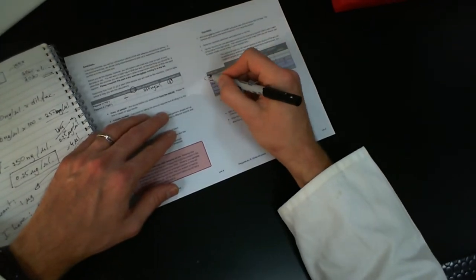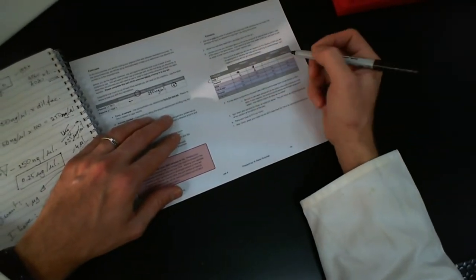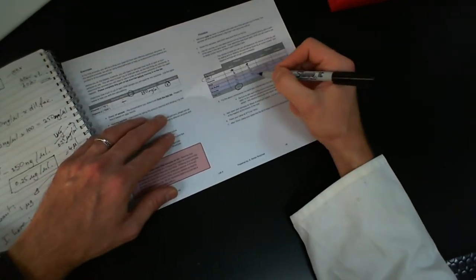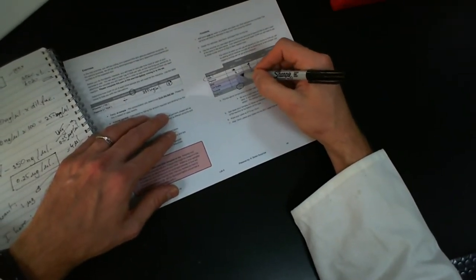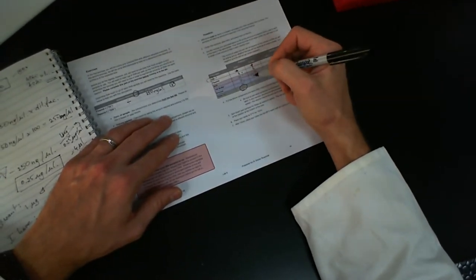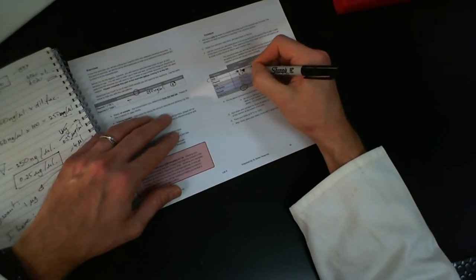And this one here, you're going to figure out based on how much plasmid you have how much water. So again, we're going to have a total volume of 20 microliters in this digest. We have a total of 6 microliters of different components being added to this, plus 4, that's going to be 10 microliters in total, which means you need 10 microliters of water.